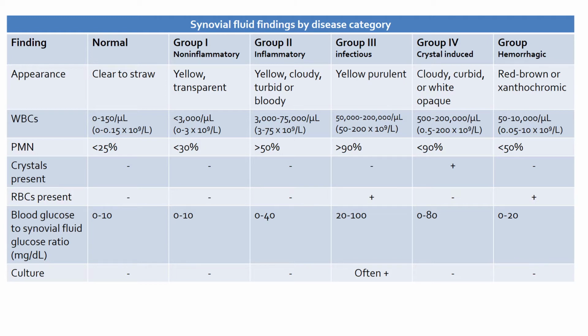And it is not necessarily unusual for us to find fragments from the actual artificial joint, and those could be metal or plastic from the joint itself in those fluids. Your hospital will have procedures written as to how you report those, but obviously if you have little flakes coming off of the joint, the joint itself might be coming to the end of its life. They don't last forever, so it depends on when the patient had it.